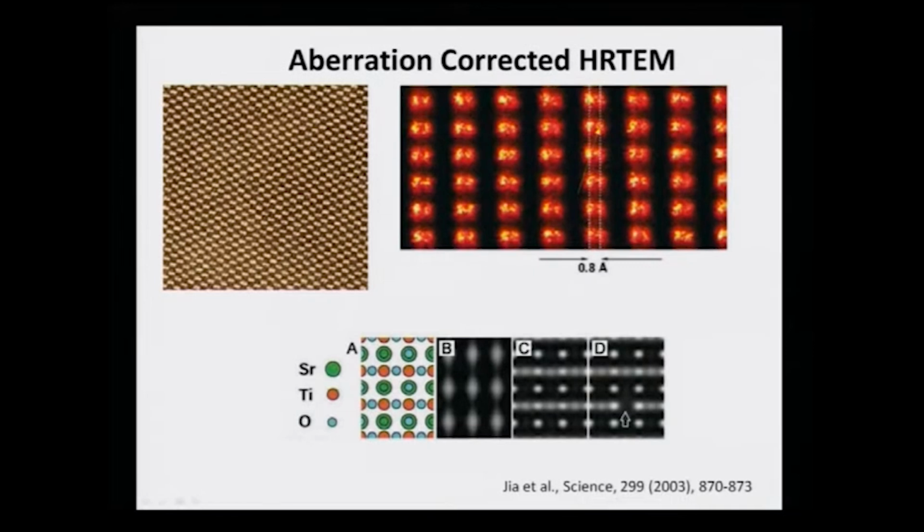High resolution microscopy has evolved quite a lot. As we stand today, we have very high power aberration corrected high resolution microscopes, in which we can even see different atomic arrangements which were not possible even a few years back. The left picture shows silicon crystals. You can even see clearly the silicon dumbbells. We know that silicon dumbbells form inside the crystals, and the silicon atomic dumbbells can be easily deciphered from this picture. The right hand side shows an information limit, or resolution level rather, of 0.8 angstrom, the distance between the centers of the two atoms in the dumbbell structure.